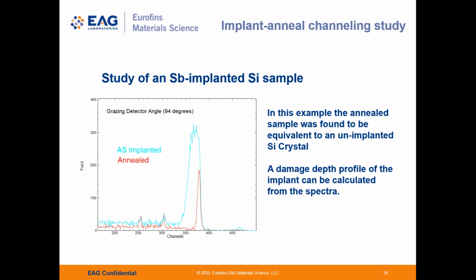Channeling yields information about the thickness and damage in the implanted zone and the effects of annealing on the crystal structure. Now to the NRA example.